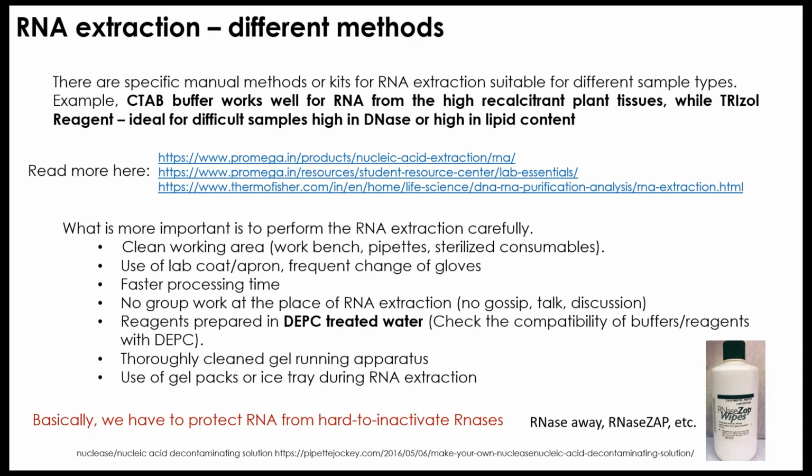You prepare it by adding 0.05 or 0.1% DEPC to water. Mix it really well for at least 15 to 20 minutes continuously, or otherwise mix it for 5 minutes, keep it on the working bench, mix it again, keep it, mix it, keep it. So at least do it for 30 to 40 minutes.